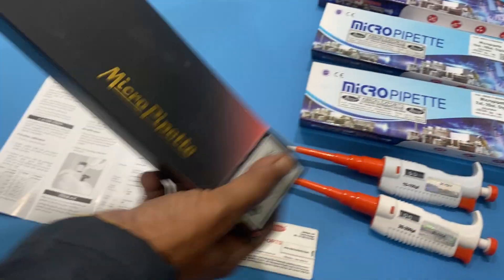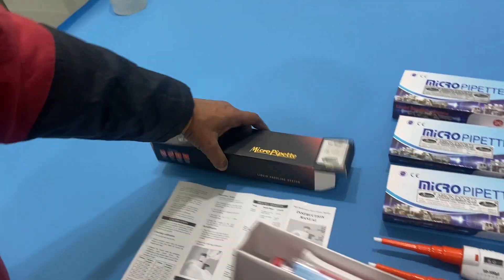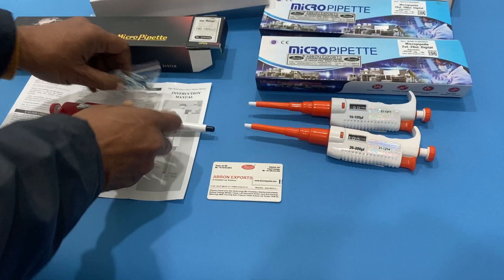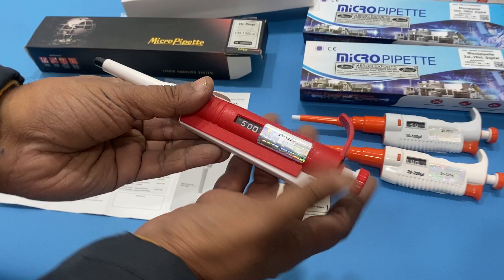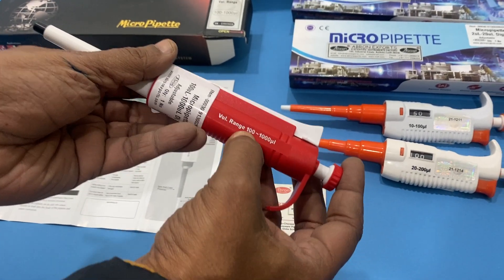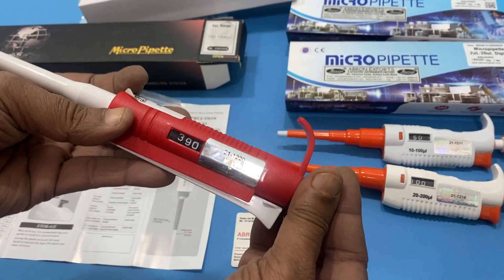When you open the packing, push on the side and take out the contents. There are three parts. One is the pipette, which is variable — it is a manual pipette. You push it and it changes; it is written up to 1000.